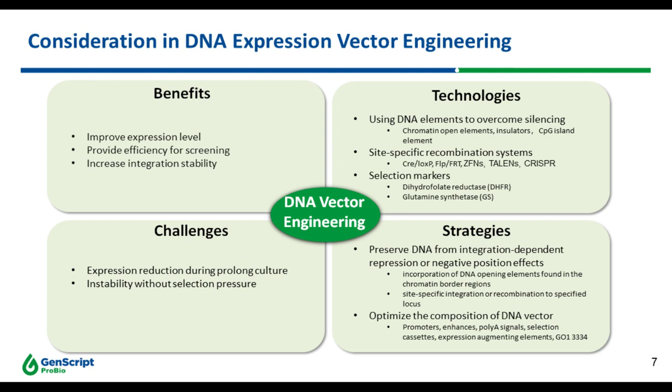For fluorescence-activated cell sorting technology, they can offer high seeding efficiency, and fewer plates are needed compared with limiting dilution for the same number of clones. And they can offer high accuracy in selection. The disadvantage is that it needs labeling. You need to label the cells with fluorescent dye in advance. Also, it may cause cell damage.